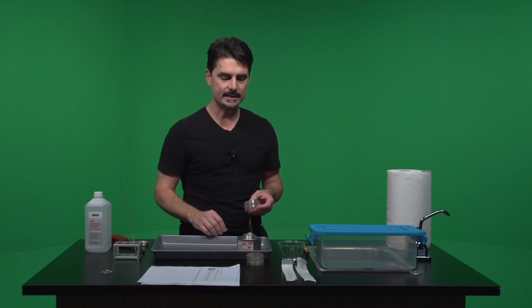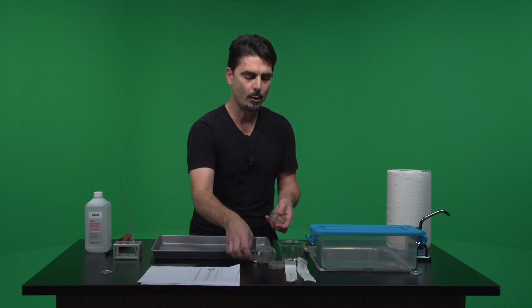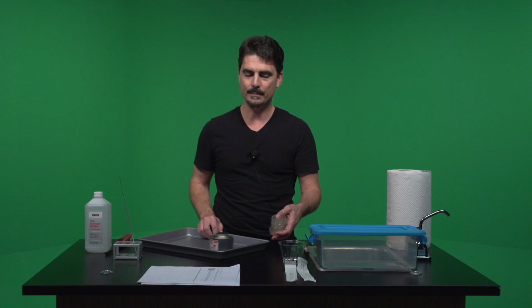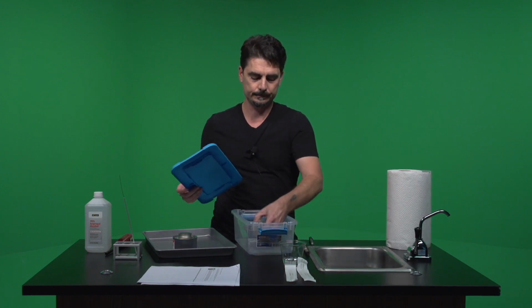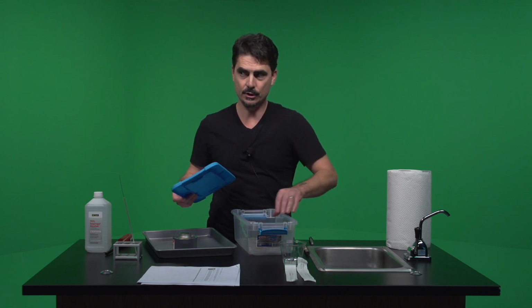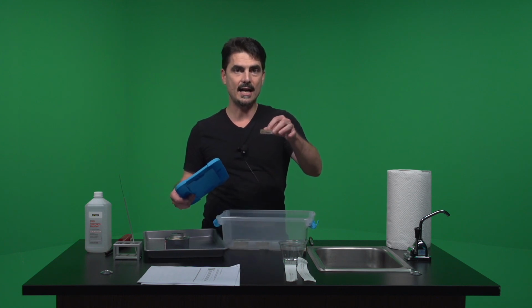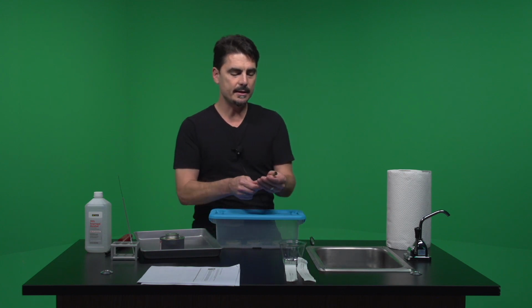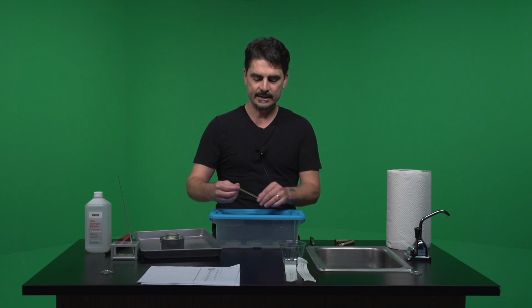Okay, so now the last thing we need to do for this, after you've done all four, right, is essentially, you don't want your plates to open up, is we then need to go ahead and put it in our incubation chamber. And what I'm doing is I am doing these essentially so that they are all agar side up, okay? And then I'm closing it up.